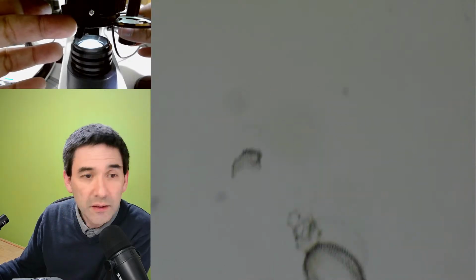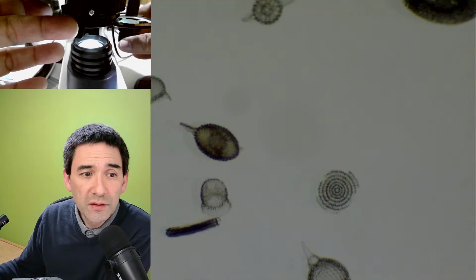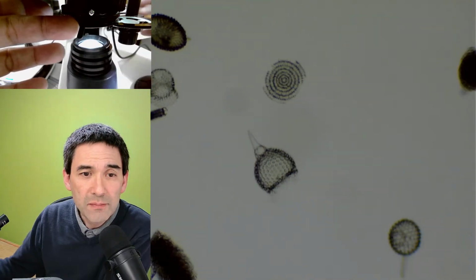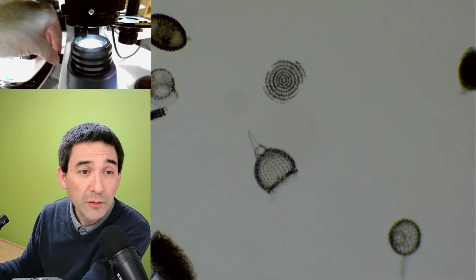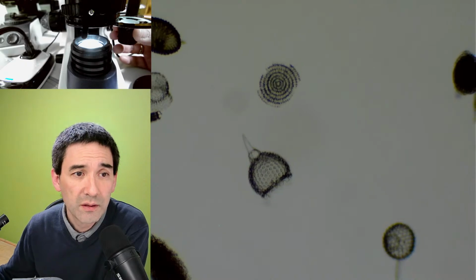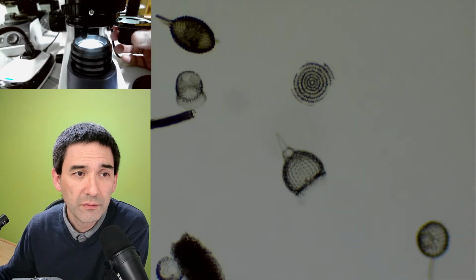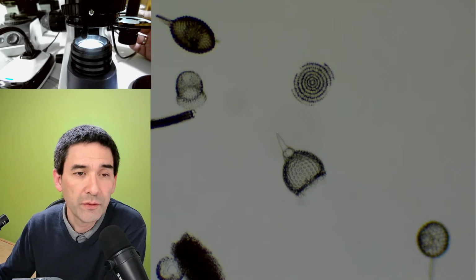I'll turn up the light a little bit, and this is how they look. These are marine, from the ocean, and they have those nice shells made of silica.